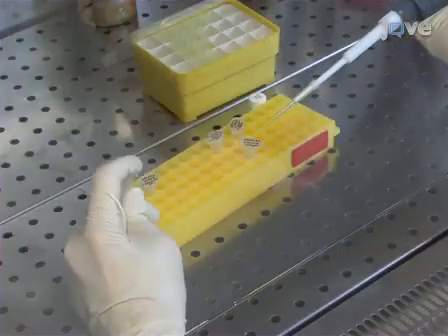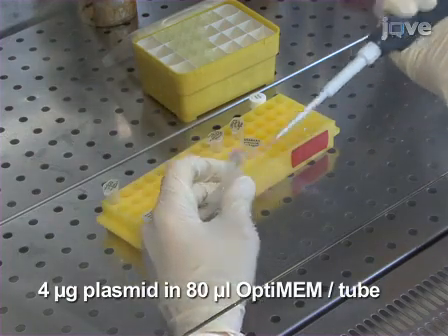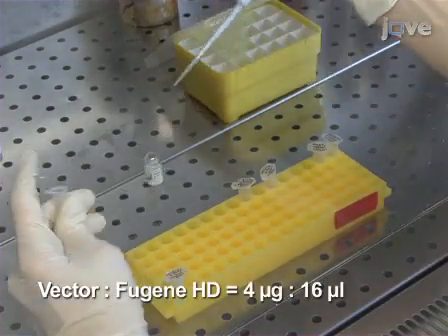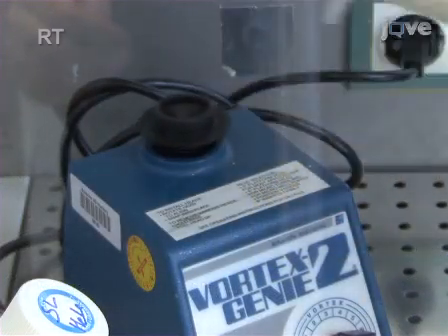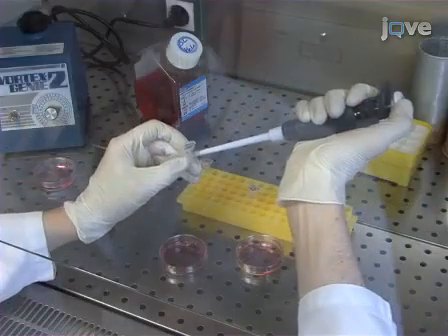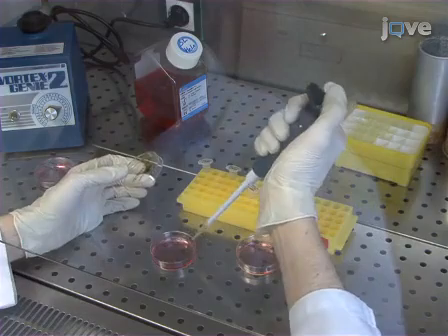Prepare the transfection reagent by adding 4 micrograms of each plasmid dissolved in 80 microliters of Opti-MEM to each tube. Then, to this, add 16 microliters of FuGENE HD transfection reagent. Gently vortex this solution and incubate it at room temperature for 10 minutes. Then, after exchanging the medium, add the plasmid mix dropwise to the seeded 5.2 × 10^5 HeLa cells and gently swirl the dish to ensure uniform distribution of the transfection complexes.